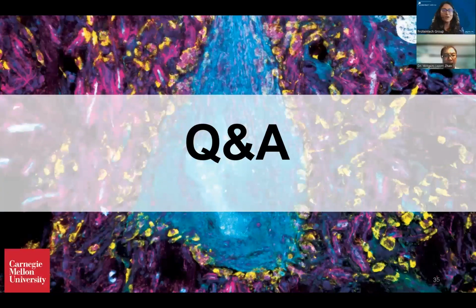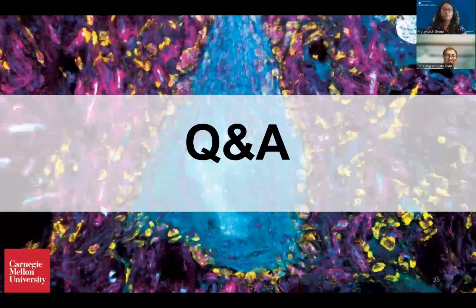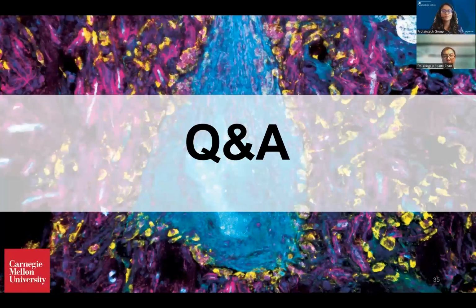Great, thank you. Our next question is, could this technology be combined with spatial transcriptomics? Yeah, that's actually something that we're working on. In theory, right now you already can do that, as I demonstrated with microMagnify. Of course, you can also use Magnify to stain different kinds of antibodies. But we are working very hard to validate as many antibodies as possible so that you will be able to use those antibodies without having to ask a question. That's number one. Number two is we are trying to generate a new format that is more friendly to the existing commercial platforms. Please stay tuned on those. Hopefully they will come out this year or next year, in the form of papers. They will allow you to do spatial biology at nanoscale much more easily.